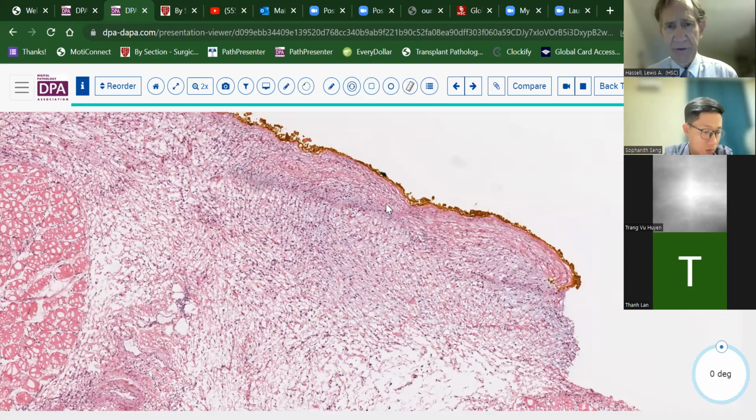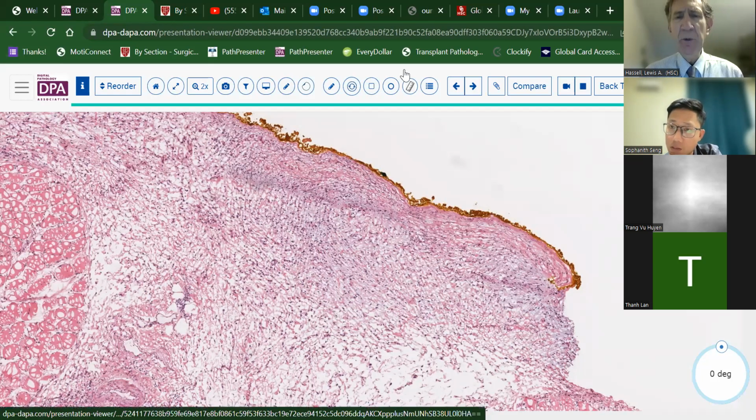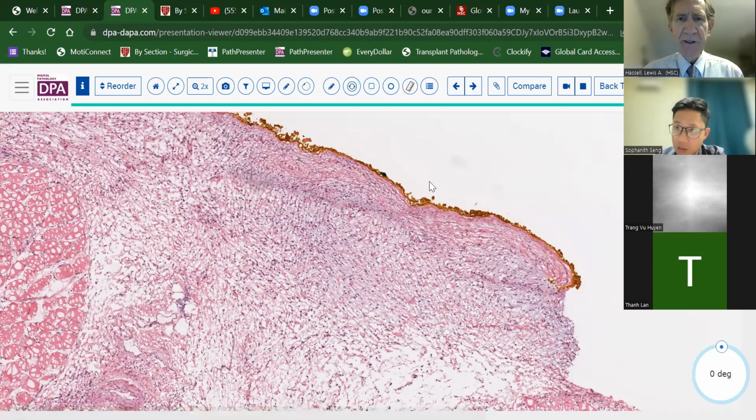For example, we also use it in the pancreas. We'll ink the bile duct yellow. We'll ink the pancreatic margin blue, and we'll ink the uncinate or retroperitoneal margin black, sort of as a routine to enable us to standardize our use of the inks and to communicate very quickly which margin we're looking at. So those are some comments on evaluating margins at frozen section and on the use of various India inks.